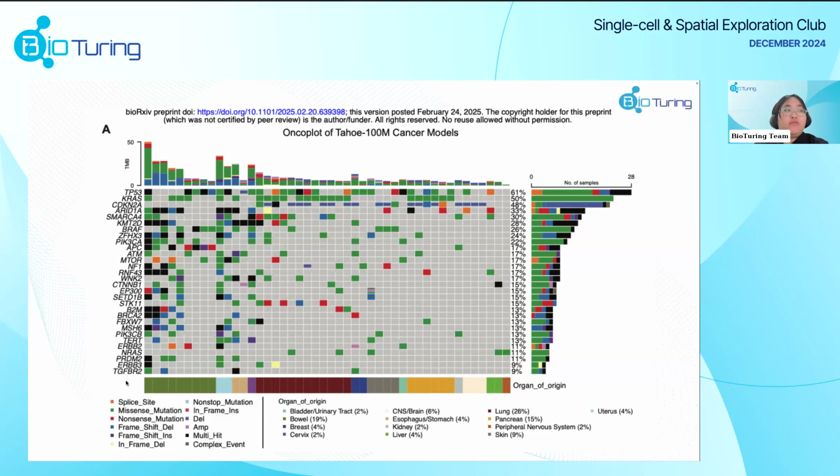On the left here, those are genetic mutations across the 47 cell lines that were well represented in the dataset. As Julie just mentioned, this dataset has 50 cell lines. However, there are 3 cell lines which were just too low in cell numbers. So we have 47 left that were really well represented.